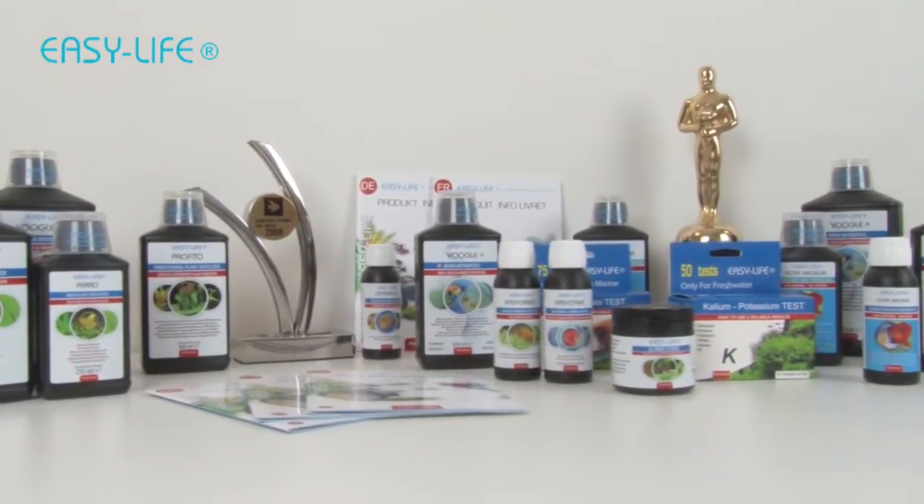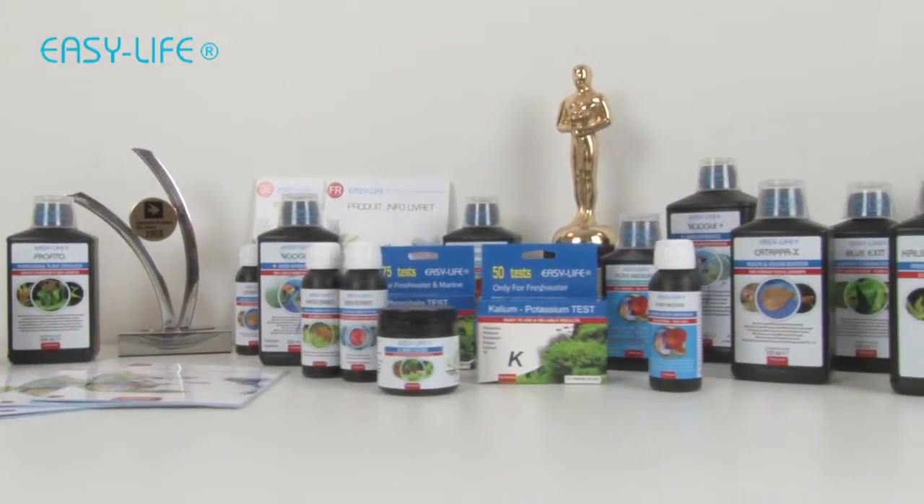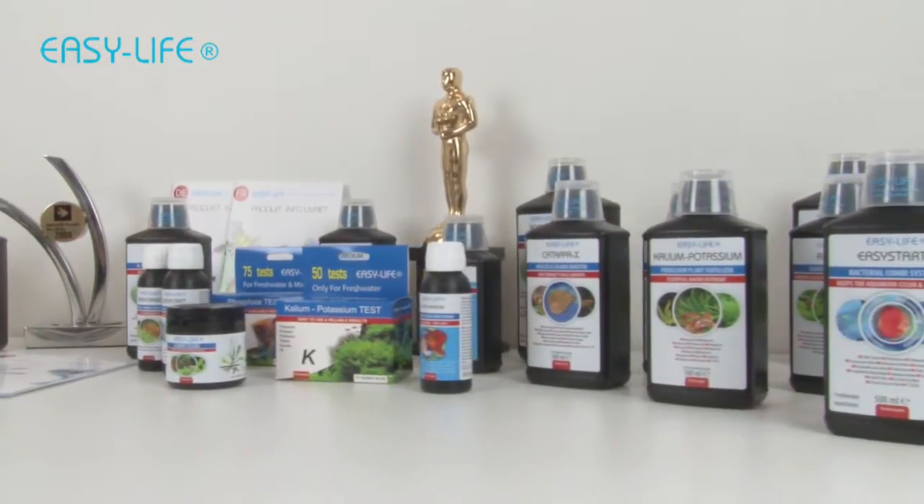Today we're going to explain the use of the unique EasyLife Phosphate Test Kit with ColorChart.